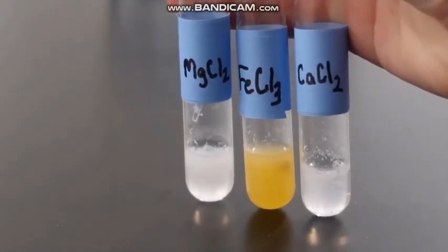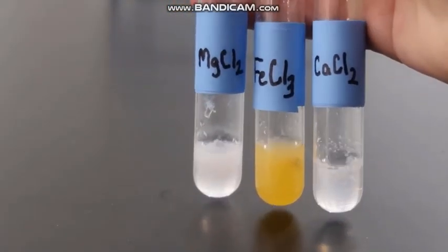Try to observe to the best of your ability whether or not you see precipitate in each of these test tubes.